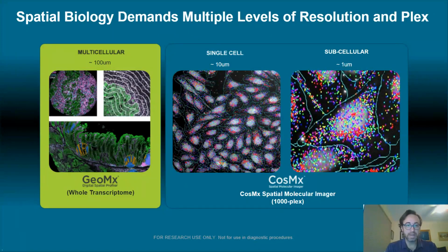As I mentioned before, the way that we set up the first Germinal Center experiment was rather broad. We took the whole Germinal Center, and we didn't have a lot of granularity as to what was happening within different regions of the tissue. Here, CosMx allows us to ask questions at the cellular level of what cells are interacting with each other and what particular marker genes might be going together within different regions of the tissue.